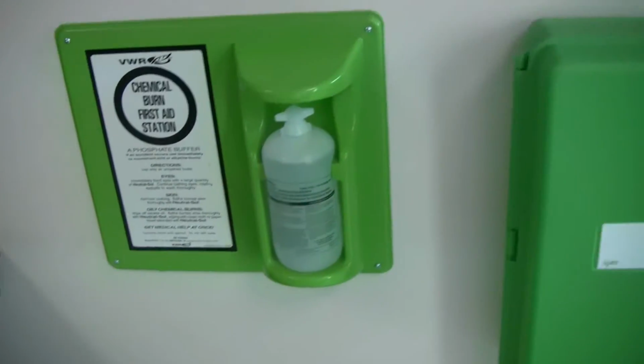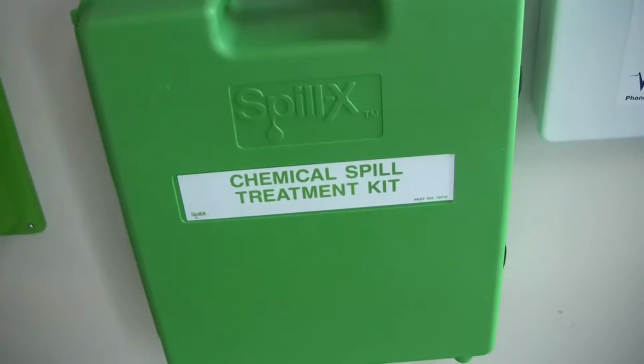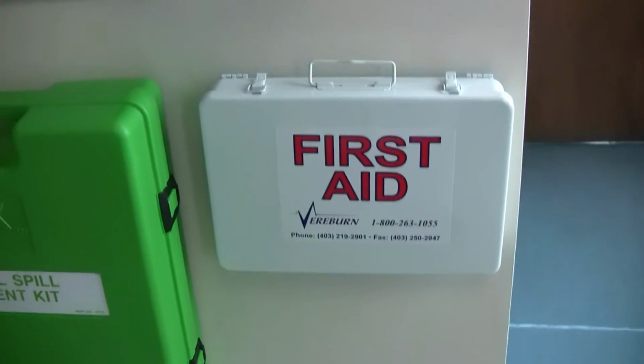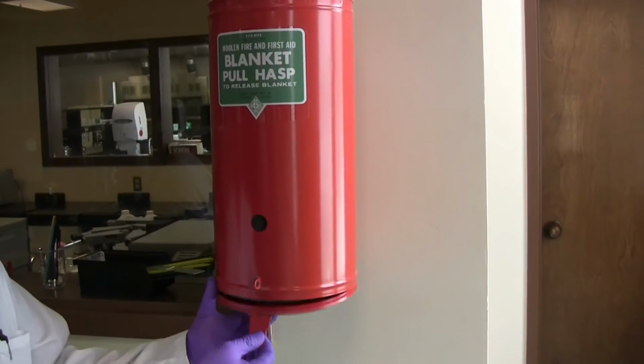To the right of the chalkboard, there is a chemical burn treatment kit, which will be used to neutralize acid or base on your skin or in your eyes, as well as a chemical spill treatment kit, first aid, and a fire blanket. Use this to put out a fire on the lab bench or another person.